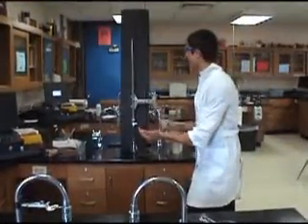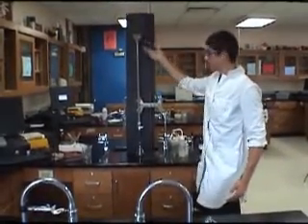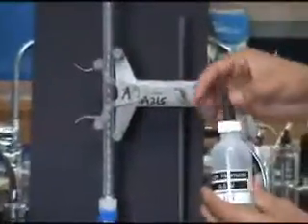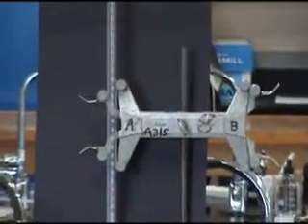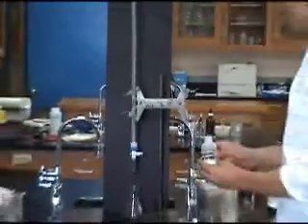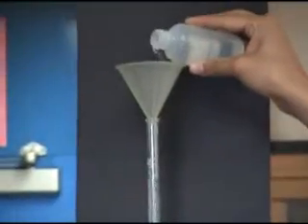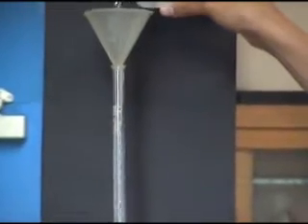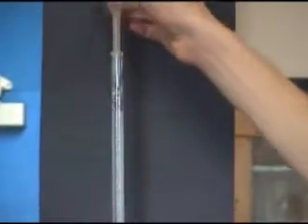Now that you've prepared a flask full of HCl solution, the next step would be to fill the burette with the NaOH solution. To do this much more easily, insert a funnel on top of the burette, then add the desired amount of sodium hydroxide. Typically, this would be filled above the zero line.